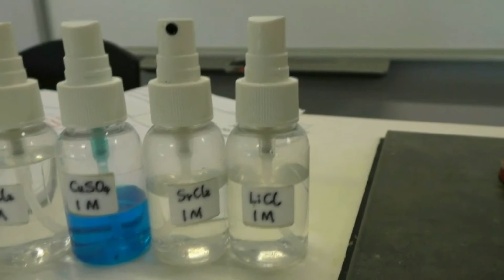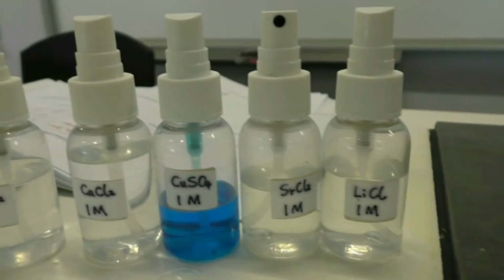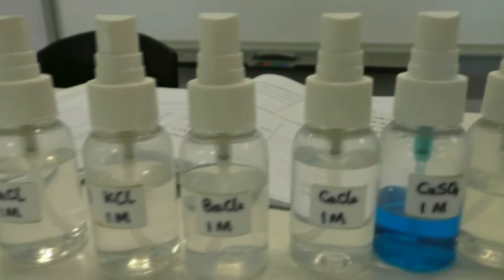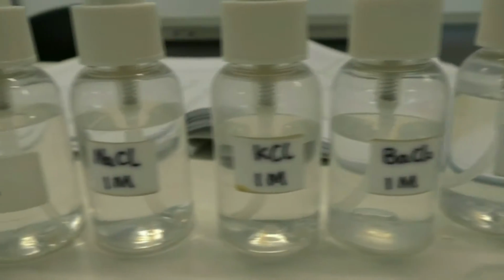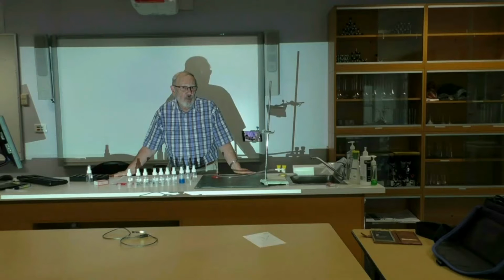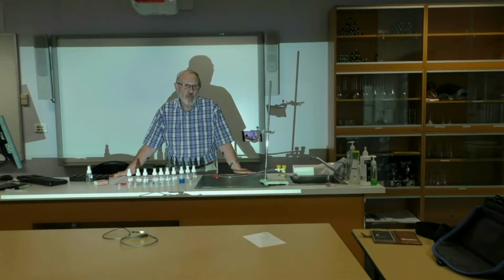What we've got are different solutions. First of all, spray bottles of lithium chloride, strontium chloride, copper sulfate, calcium chloride, barium chloride, potassium chloride, some sodium chloride, and a number of unknown cations. So we should be able to sort out what those unknown cations are. So let's have a look at the flame test first of all. What you'll need to do as I carry out these flame tests is to record the results in your workbook.